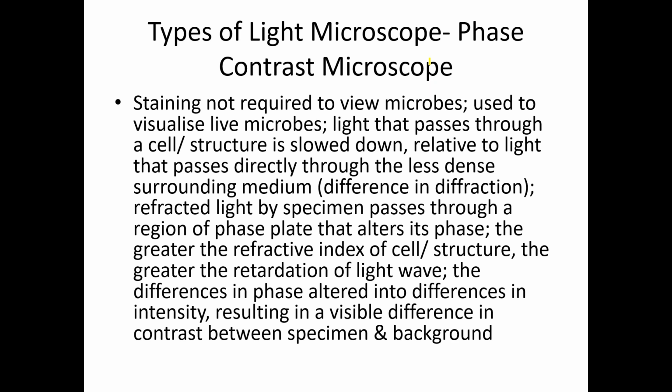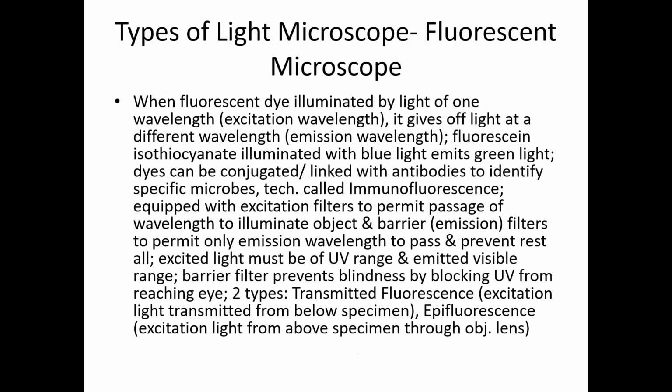So this is another type of light microscope. Now, why I took this topic is, in your syllabus they have clearly mentioned microscope, visualization of live microorganisms.